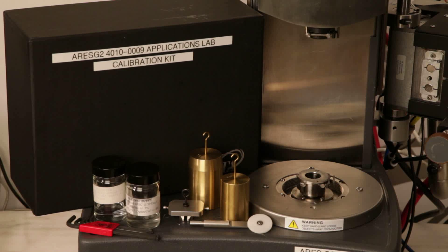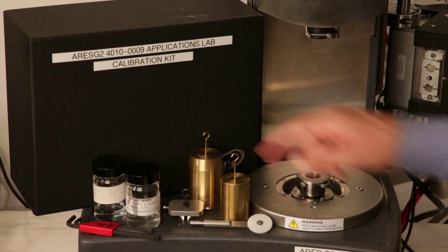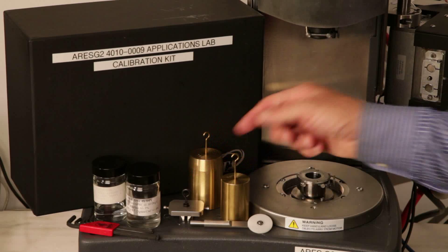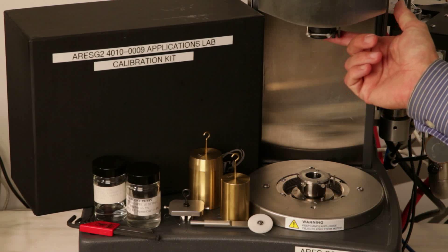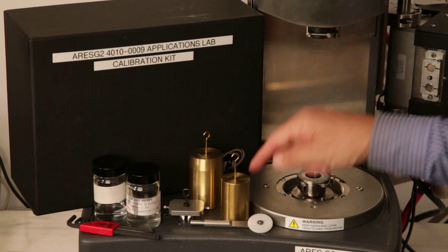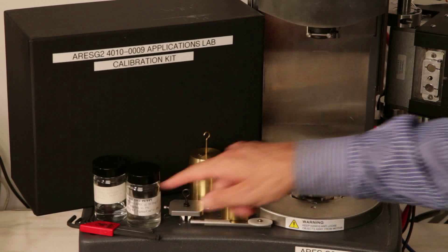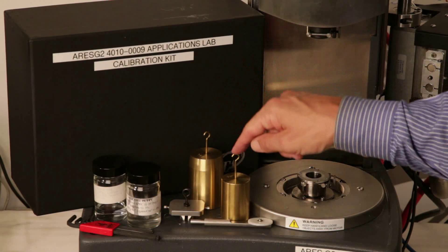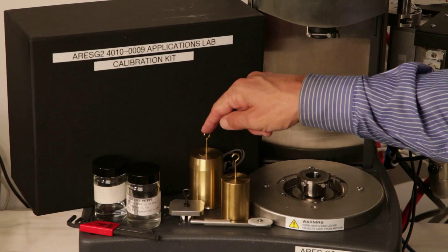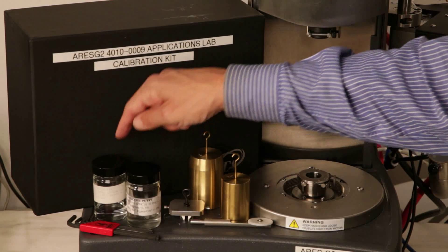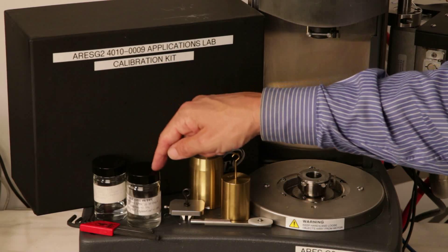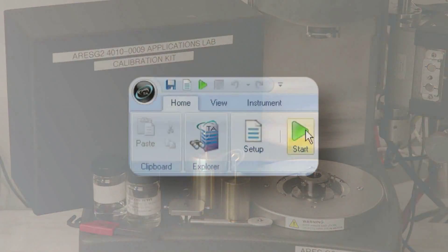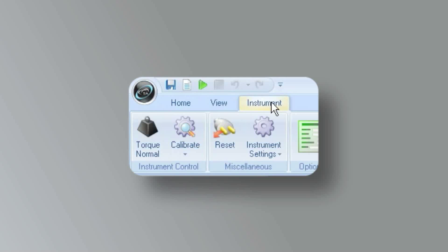The calibration kit includes a calibration fixture which will be installed on the FRT transducer shaft, a pulley, string, tools, a 500 gram weight, a 1000 gram weight, some standard oil, and silicone putty.